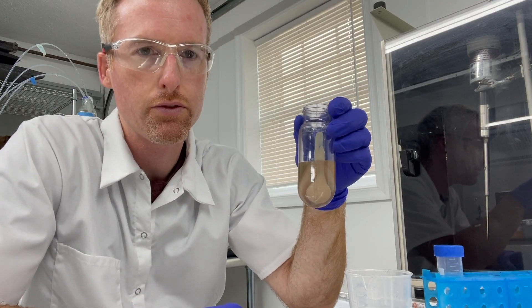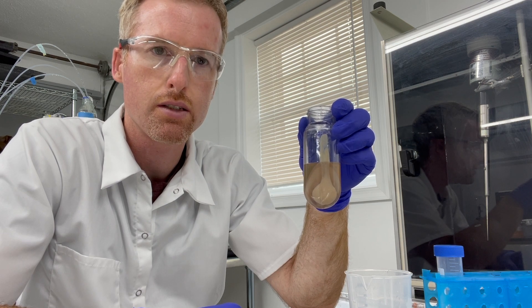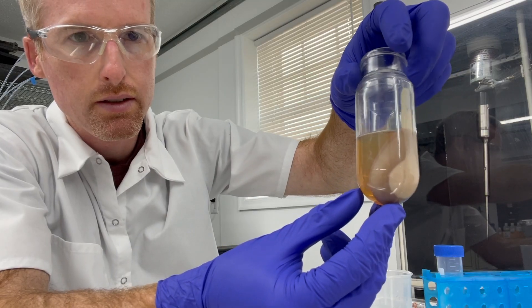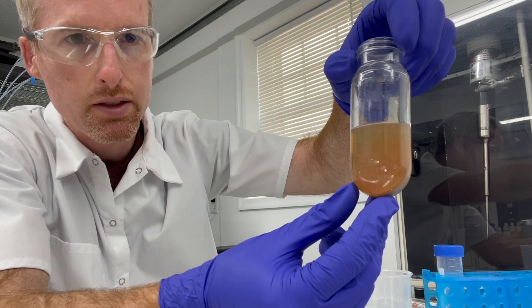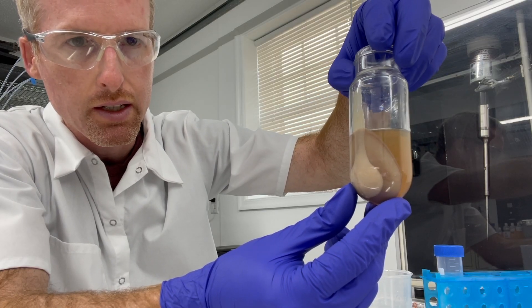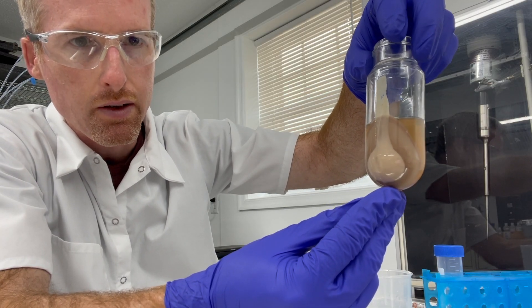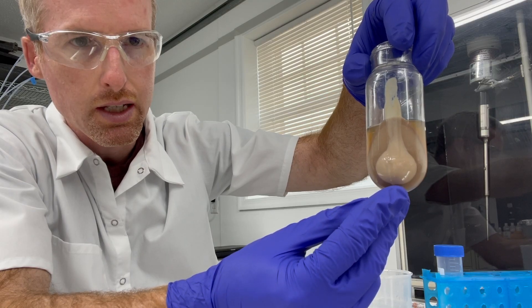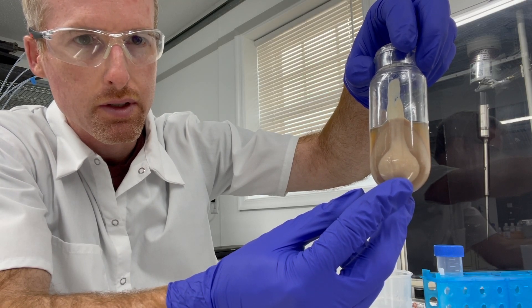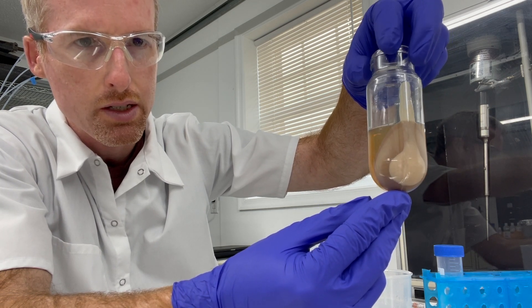Okay so I centrifuged the sonicated cells at 18,000 times G for 15 minutes and this is what I got. You can see I have this tea-colored lysate where the protein of interest should be, and then I have this two-toned cell pellet where the cell debris is. Now if my protein of interest is insoluble, a lot of times there will be a large white layer on the inside of this, but I don't have that this time.